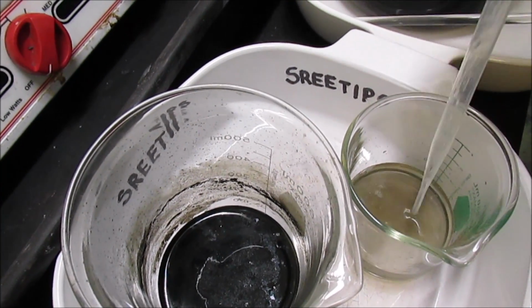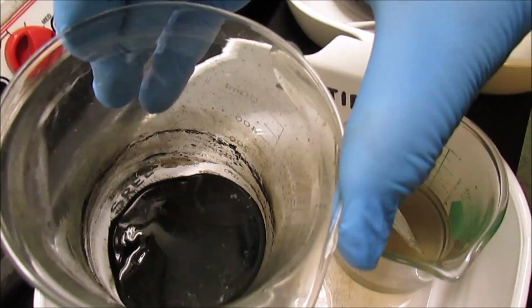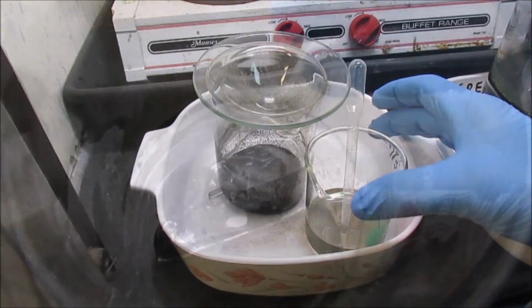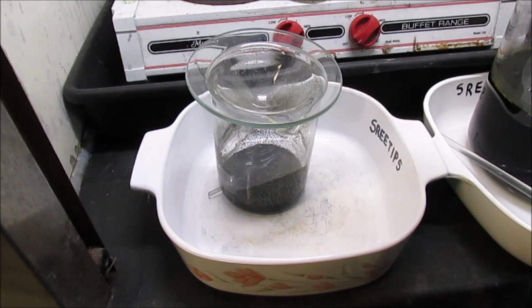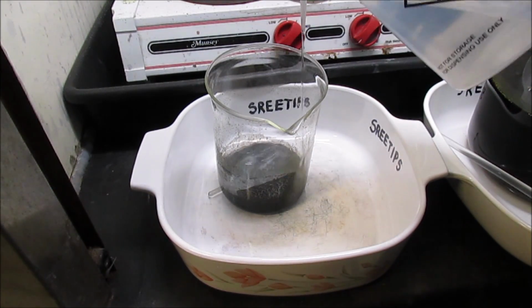About it as far as I can go. That's our mixed PGM black powder that was cemented out with zinc. It's a nice goodly amount there. This liquid here will go in my stock pot, and what we'll do now is rinse this out, this black powder. It's distilled water.